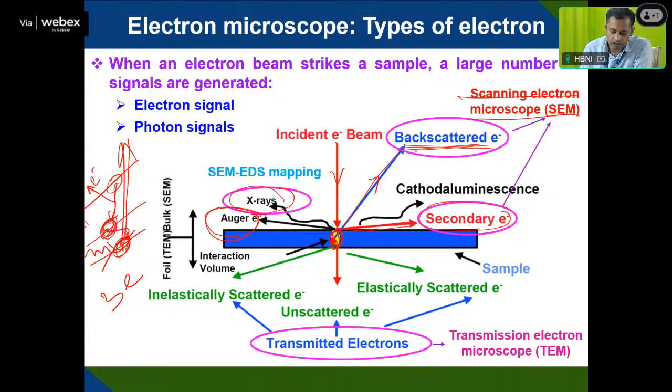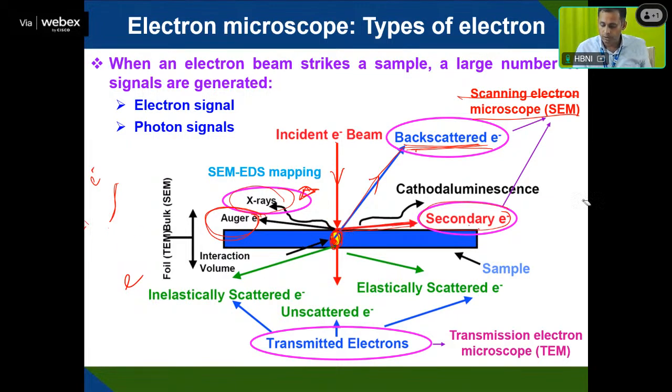The electron coming in is also used in X-ray photoelectron spectroscopy, because of the photoelectric effect, and the knockout electron can be used for it. In addition, we also have cathodoluminescence. Some emission is possible, and you can use it for luminescence studies and obtain some luminescence characteristics.